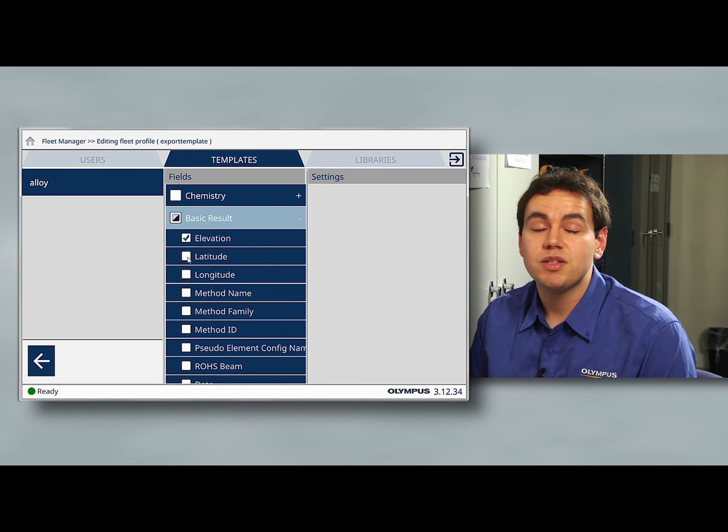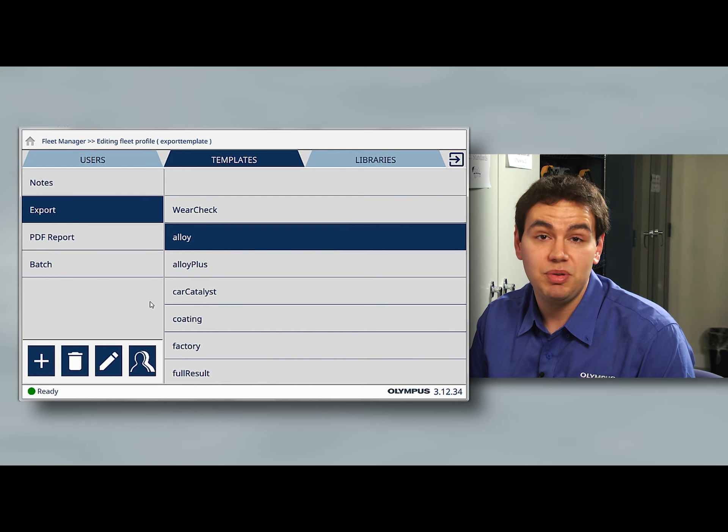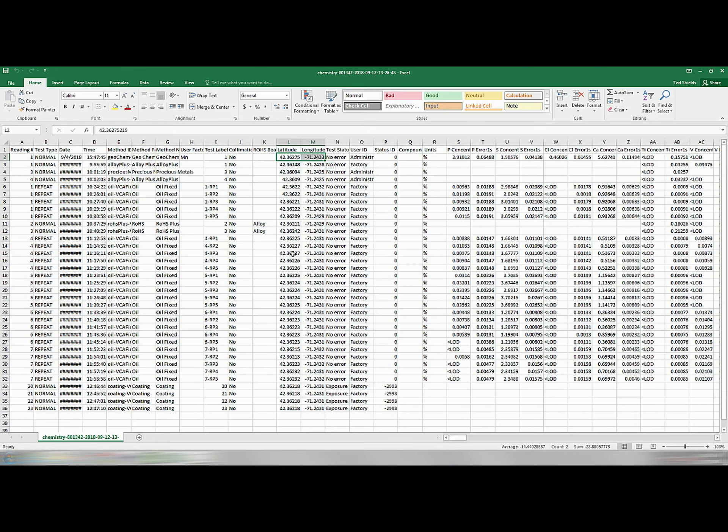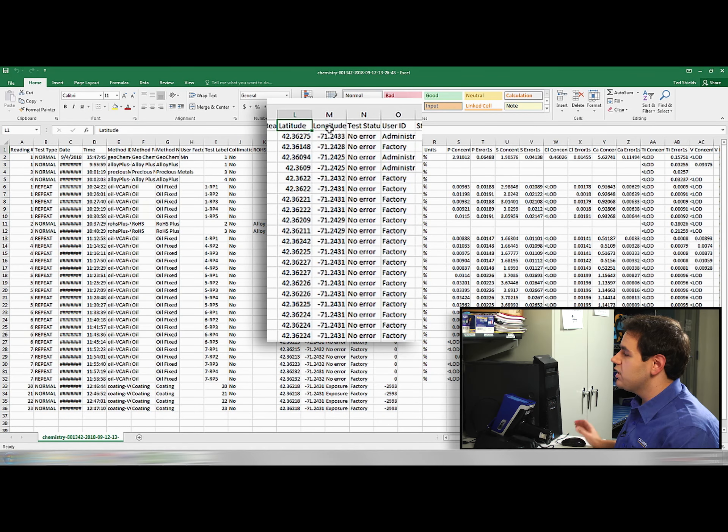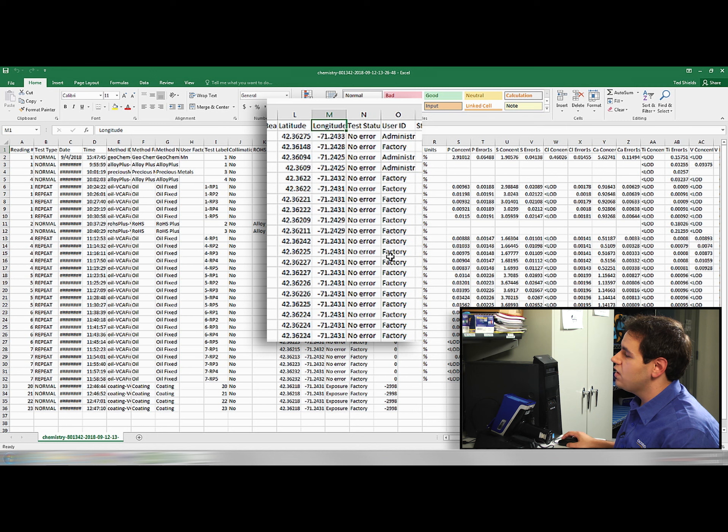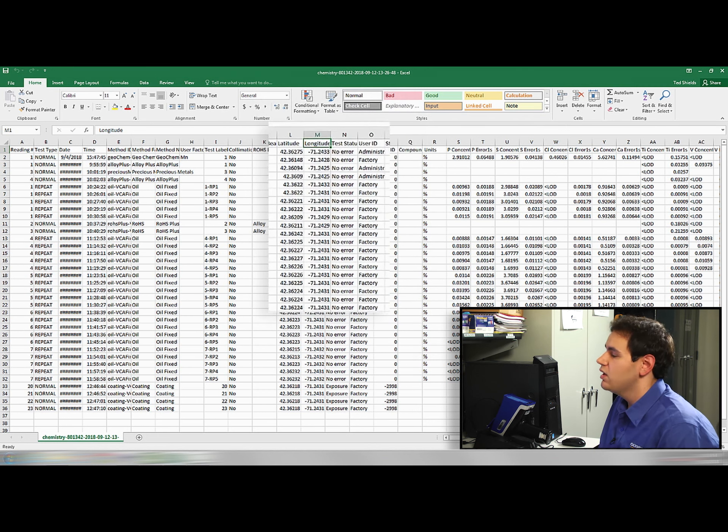For example, the samples that we collected on this day, you can see all the latitude and longitude values for all the samples we collected here.